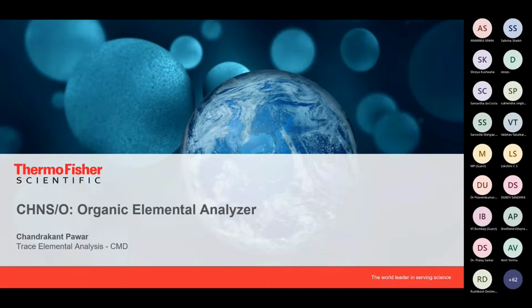In elemental analysis with AS, ICP OES or ICP MS, we can analyze most of the elements in the periodic table. But by ICP MS or ICP OES, we can't analyze carbon, hydrogen or oxygen. Yes, we can analyze sulfur, no doubt, but we can't analyze nitrogen. For that elemental analysis, CHNSO is useful.